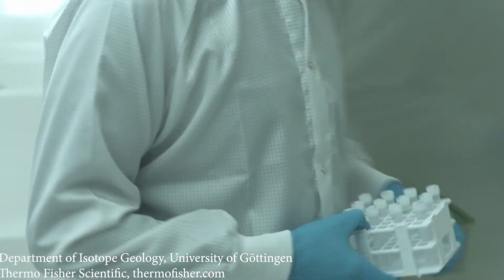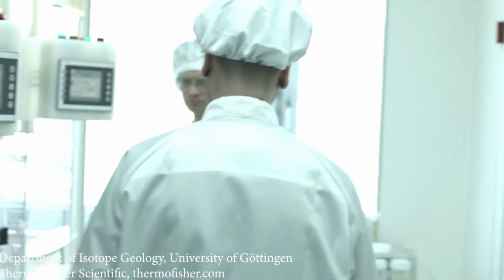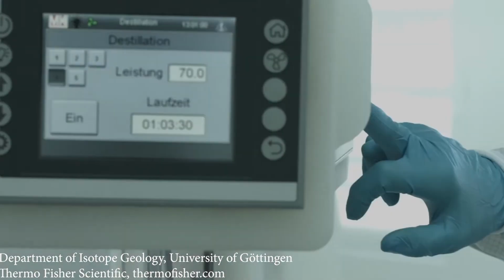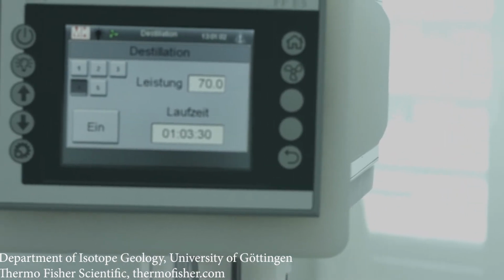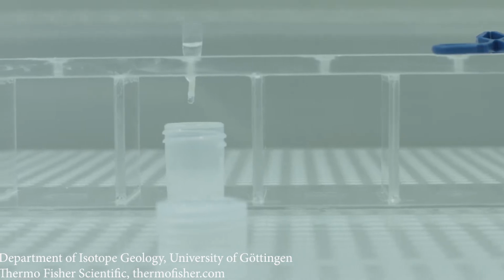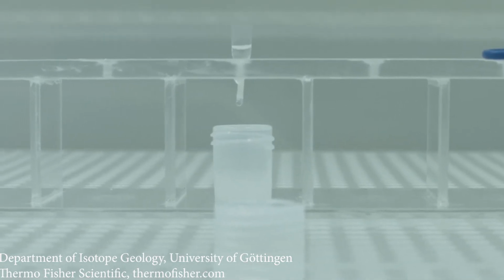So when you look at these minor variations in isotopes, when you look at isotope ratios, you have to do it in these clean rooms and be very, very careful with a very high level of precision. It's very, very careful, very sensitive work. But you can see noticeable differences in these isotope ratios.